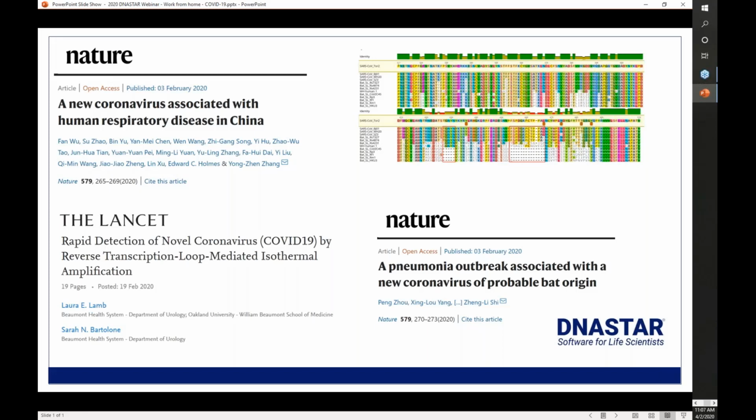So we have a number of different tools in the suite. For example, we have some helpful tools to search NCBI databases, tools to do similarity searches for NCBI, Swiss-Prot, and Protein Data Bank, as well as tools to bring in annotated data via Entrez, and direct 3-dimensional images via Protein Data Bank. We also have more advanced tools using cloud resources.